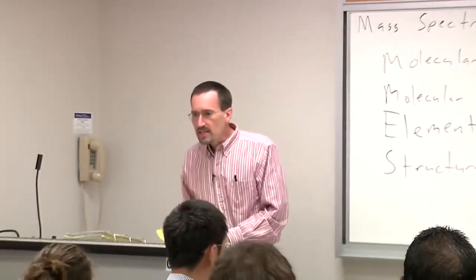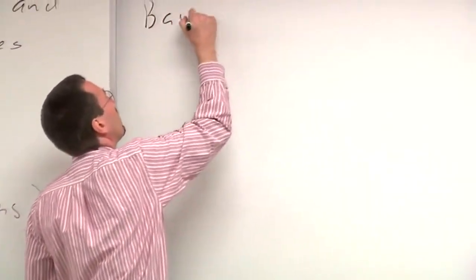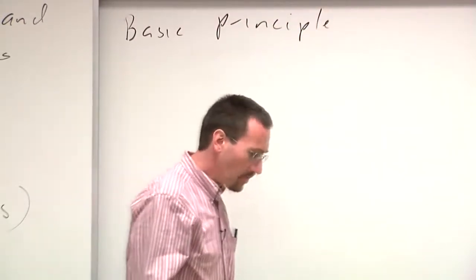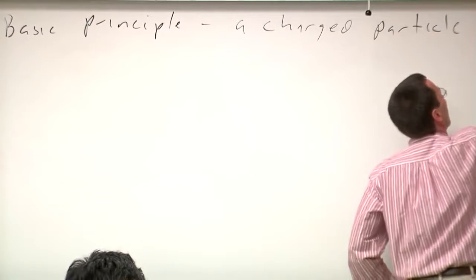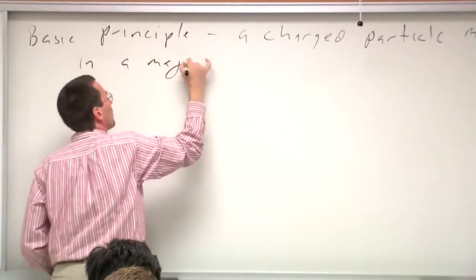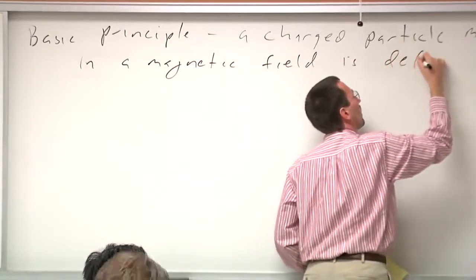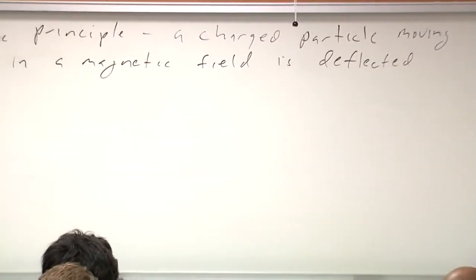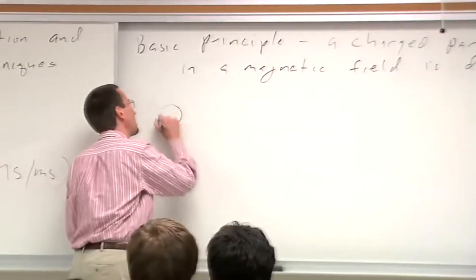All right. The basic principle of mass spectrometry is super simple, like beginning physics. I love making these very simple-minded drawings of scientific instruments because it's a good way to get into our heads how the basic technique works.